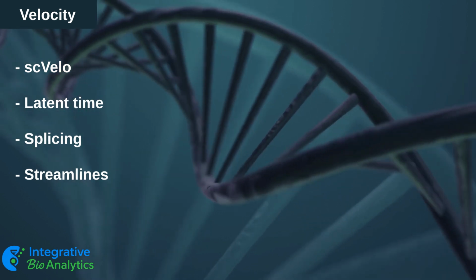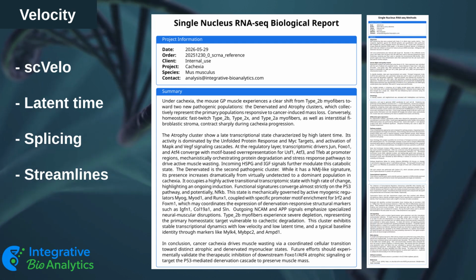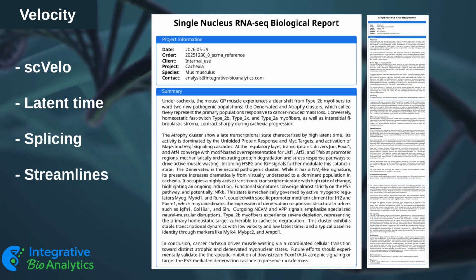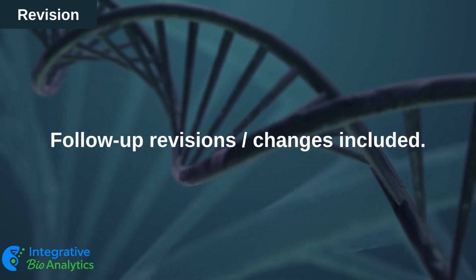Finally, you will receive a biological report with analysis highlights and detailed methods to help you with manuscript preparation. Every analysis includes follow-up time for revisions and minor changes.